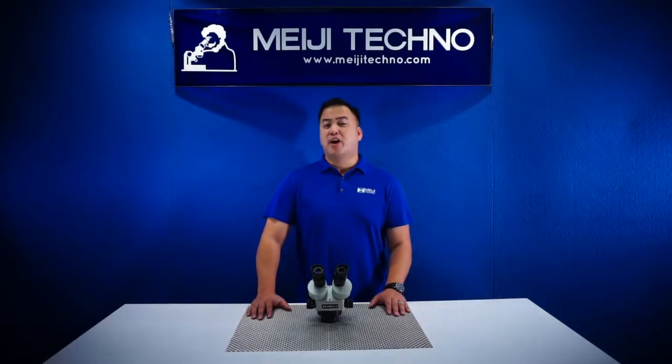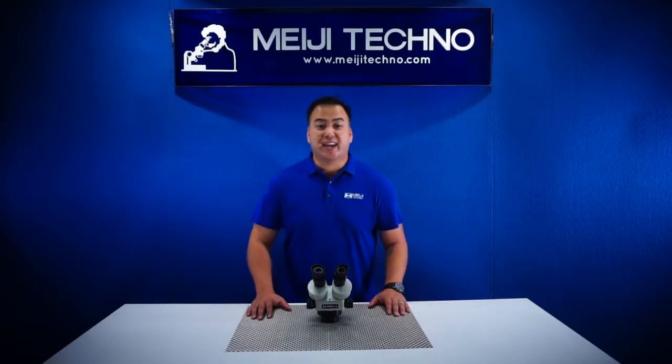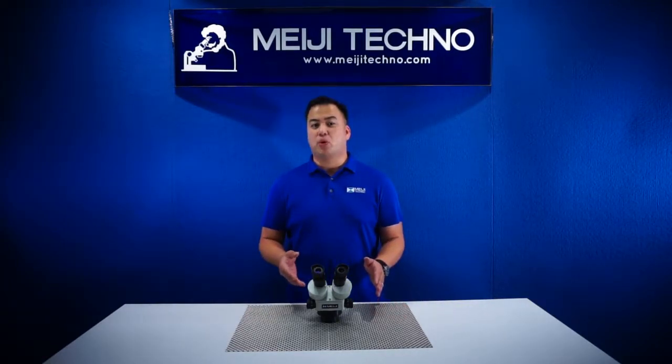The EMZ5 provides a long-lasting and superior quality. It's really built like a tank, and that's the reason it comes with a limited lifetime warranty.